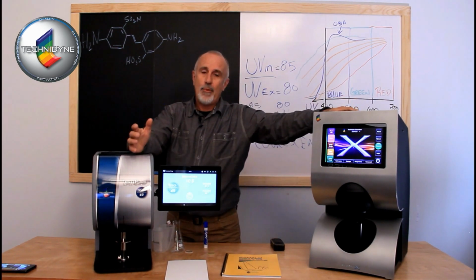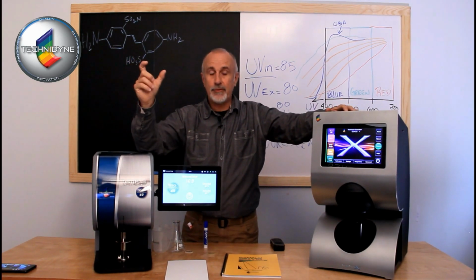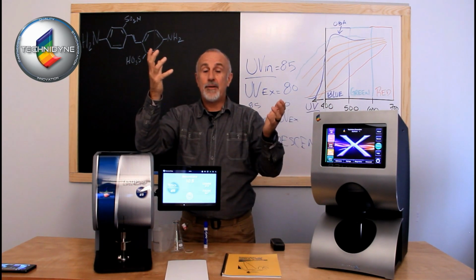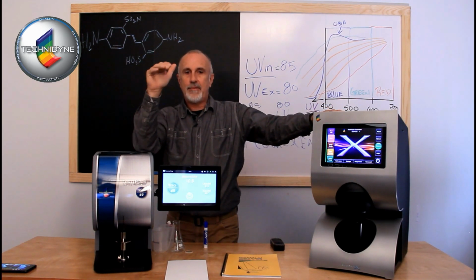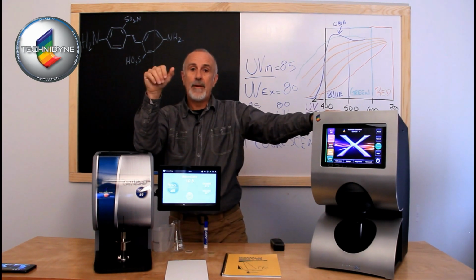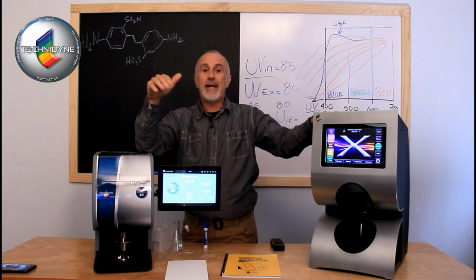And so at that point they implemented a procedure where you would use a 395 trim filter, and that trim filter would be adjusted so that it was blocking a certain amount of ultraviolet energy from the xenon flash lamp so that you could get a consistent UV content level from your light source to be able to measure properly with that. So ISO then defined this source C for measuring ISO brightness.